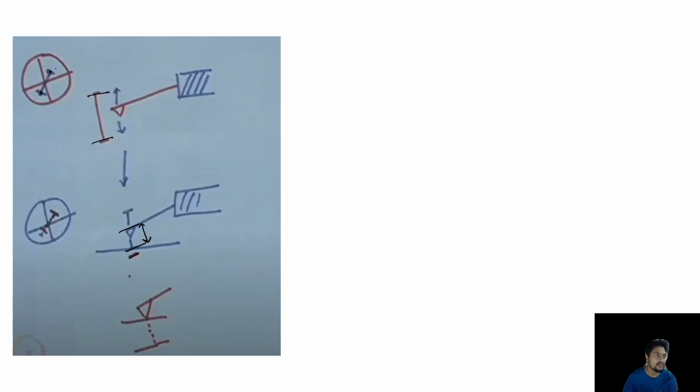Now, as it is vibrating, we are always getting, let's say, this is the free resonant position. So whenever it is at the surface, instead of this point, which it should reach, we are getting only up to this. And whenever it is much closer, the point will be much lower. Like that, this is one, this is two. So depending upon that, we are going to get the picture, right?